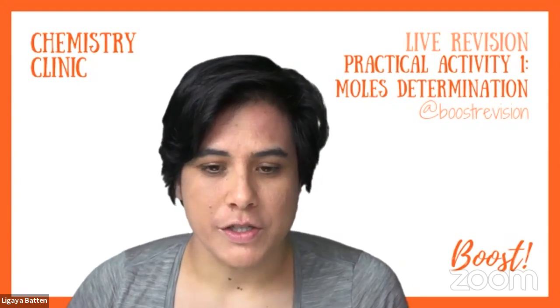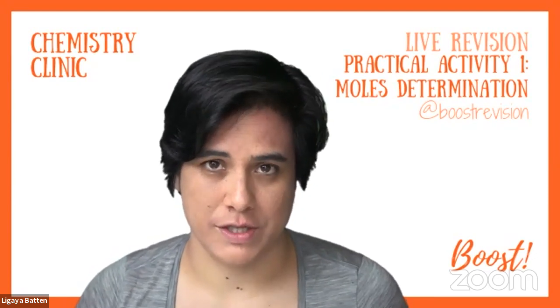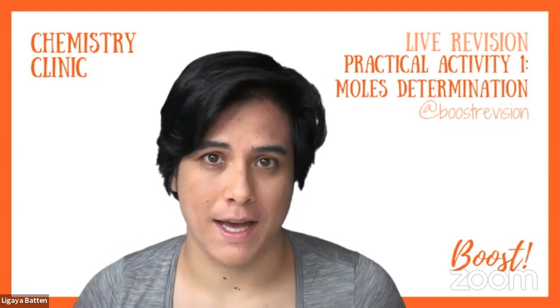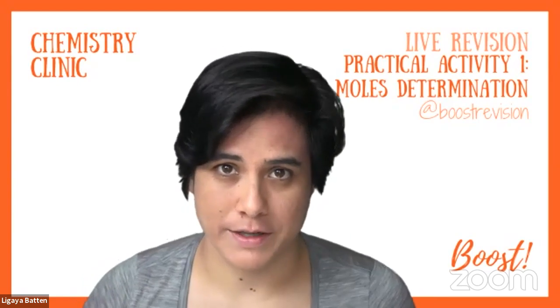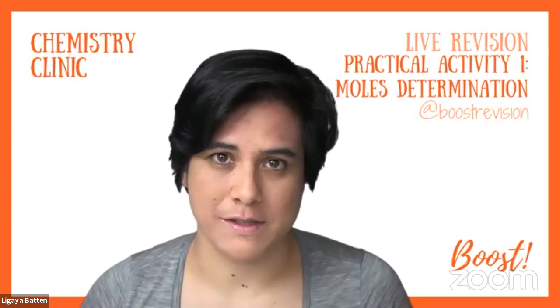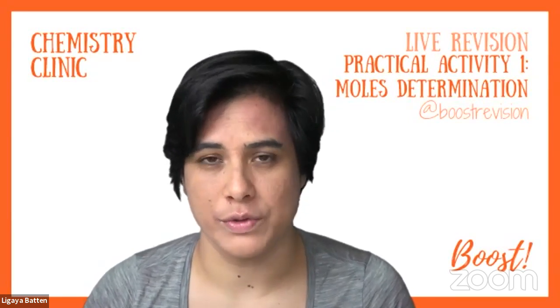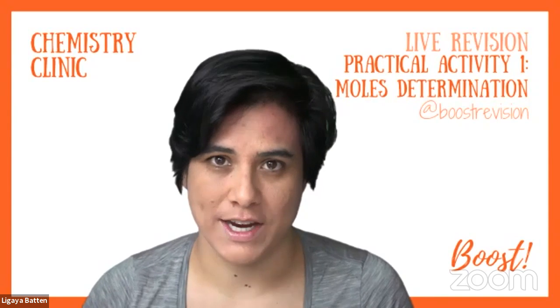So what we're going to do today is, first of all, take a little bit of time just to review the main moles equations that you'll need to know in order to apply those equations to the practical questions. And then we'll go through an example of two different types of practicals that you can use to measure or determine the moles that are reacting in your equation.